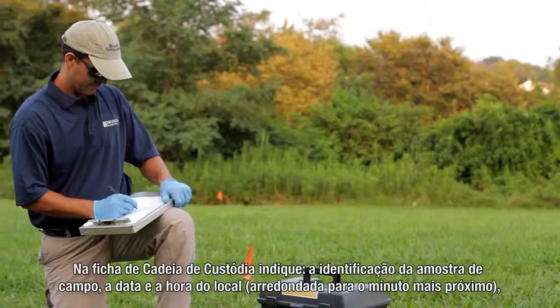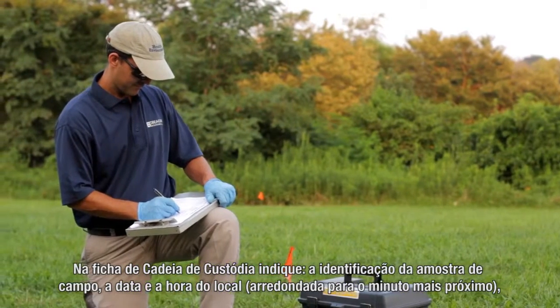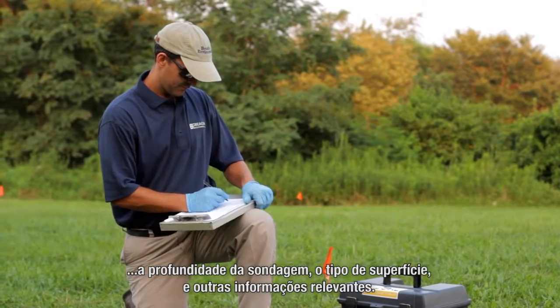On the provided chain of custody, record the field sample ID, the date and time of emplacement to the nearest minute, the sampling hole depth, the type of surfacing, and other relevant information.